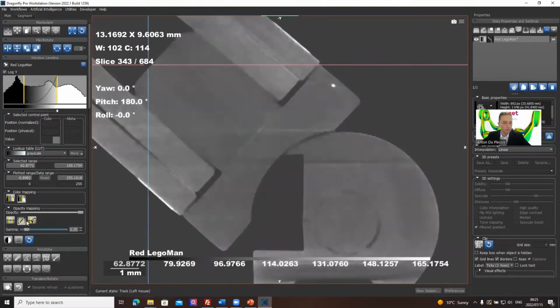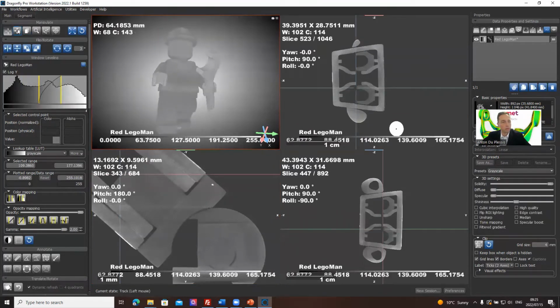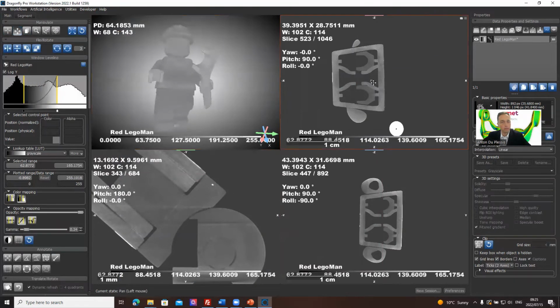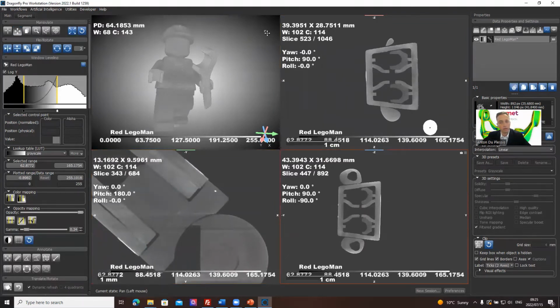I actually wanted to show the manipulate tools. So I was dragging around with the mouse shortcut, but you can also click on this panning tool, and this is active continuously. And when you're in any other mode and you want to get back to default mode, you press the escape button on the keyboard.